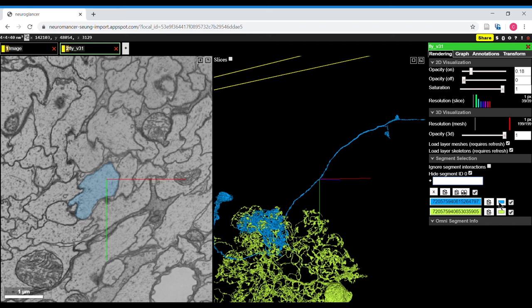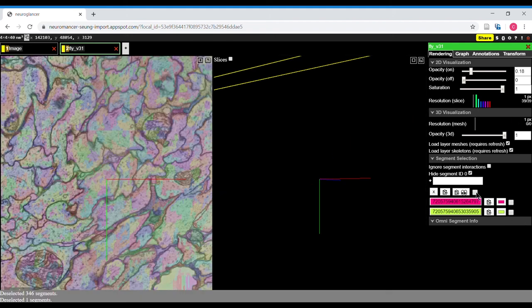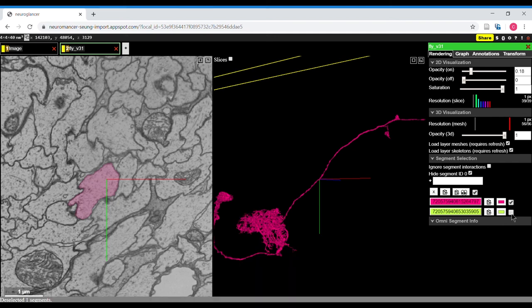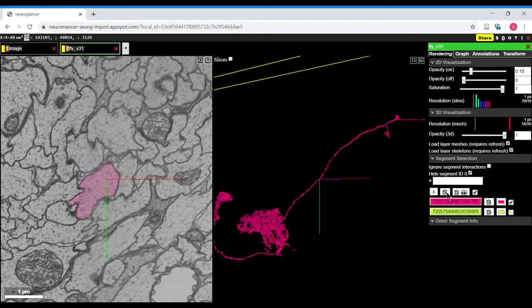You can change the color of a segment here. This check mark allows you to hide or reveal all segments. This allows you to copy all visible segment IDs. So if this were hidden, then this button would only copy the pink one. This allows you to copy all segment IDs, and this allows you to delete all segment IDs.